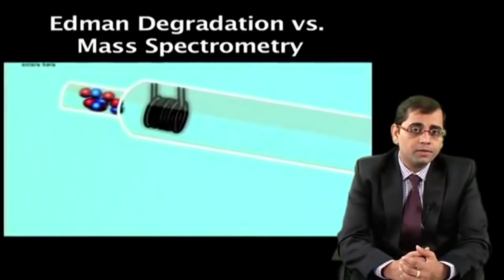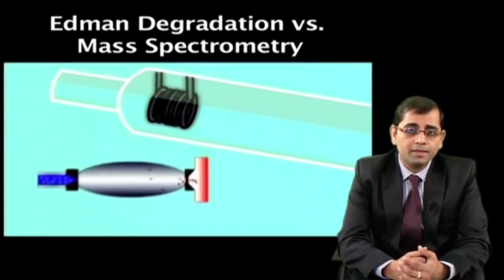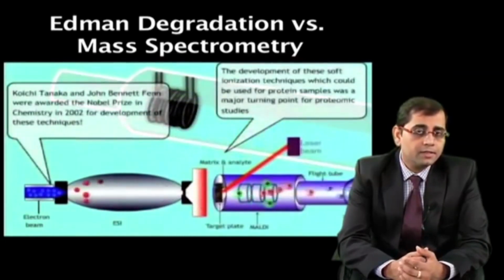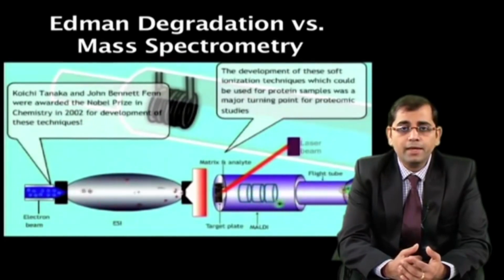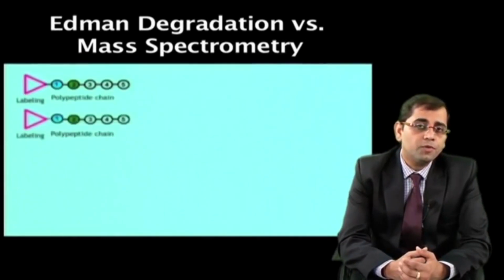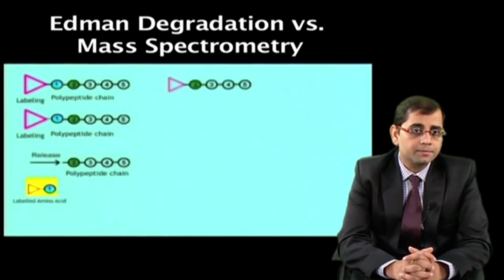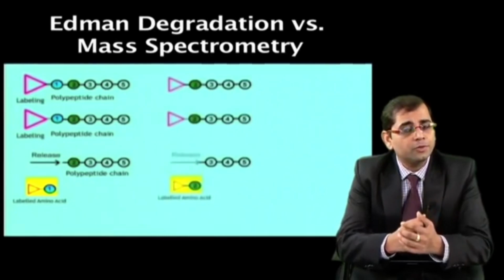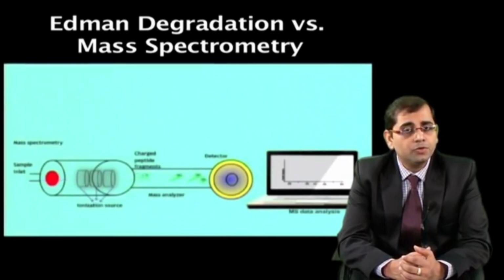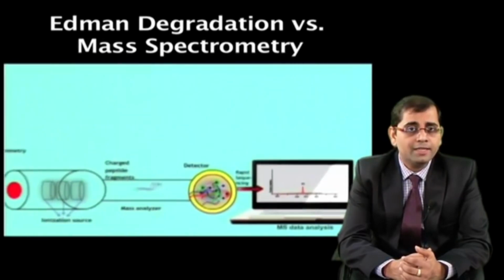Lecture 1 will focus on basic understanding of proteomics. The technological advancements in analytical techniques with increased sensitivity, resolution, and capability to carry out high throughput studies have led to the transition from protein chemistry to the new field of proteomics. How limitations of mass spectrometry for protein analysis were overcome by development of soft ionization techniques such as MALDI and ESI will be discussed in this lecture.